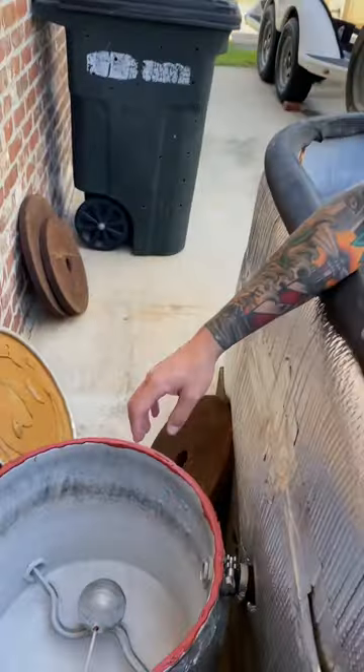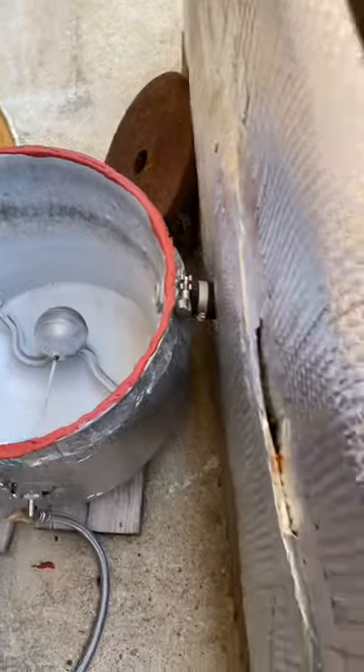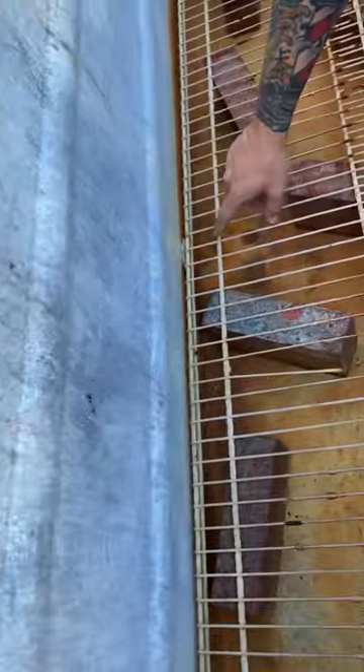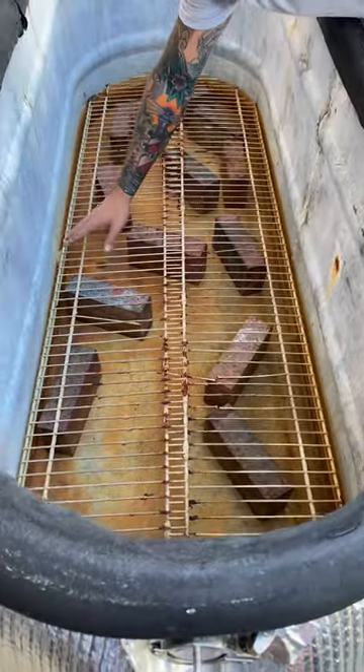This creates the steam. The steam rises and goes through here, comes through this. Our bricks here keep the bags above the steam line so the steam just dissipates and raises up all through here.